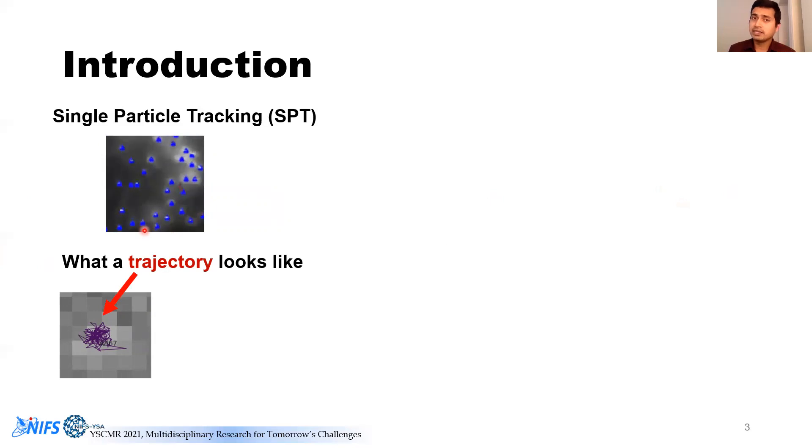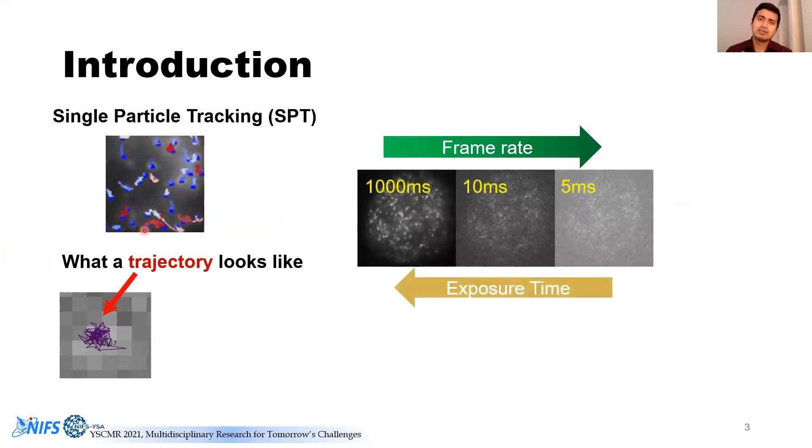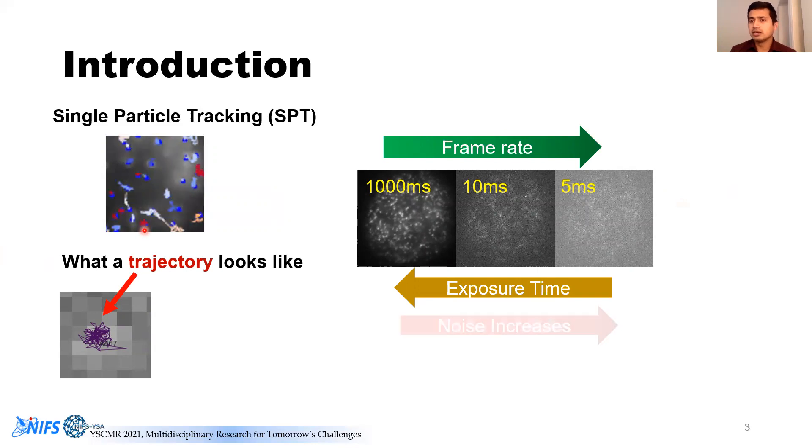A common problem that we have is that when we want to observe very fast moving particles, we want to go for higher frame rates, which means the camera speed is going to increase. As you go for higher frame rates, this is a flaw in every camera, you lose on exposure time. When you lose on exposure time, the noise of the images increases. And when you have high noise, it is impossible to do any tracking. As you see here in this five millisecond photograph, there's nothing much you can track out of it compared to its thousand millisecond photo.